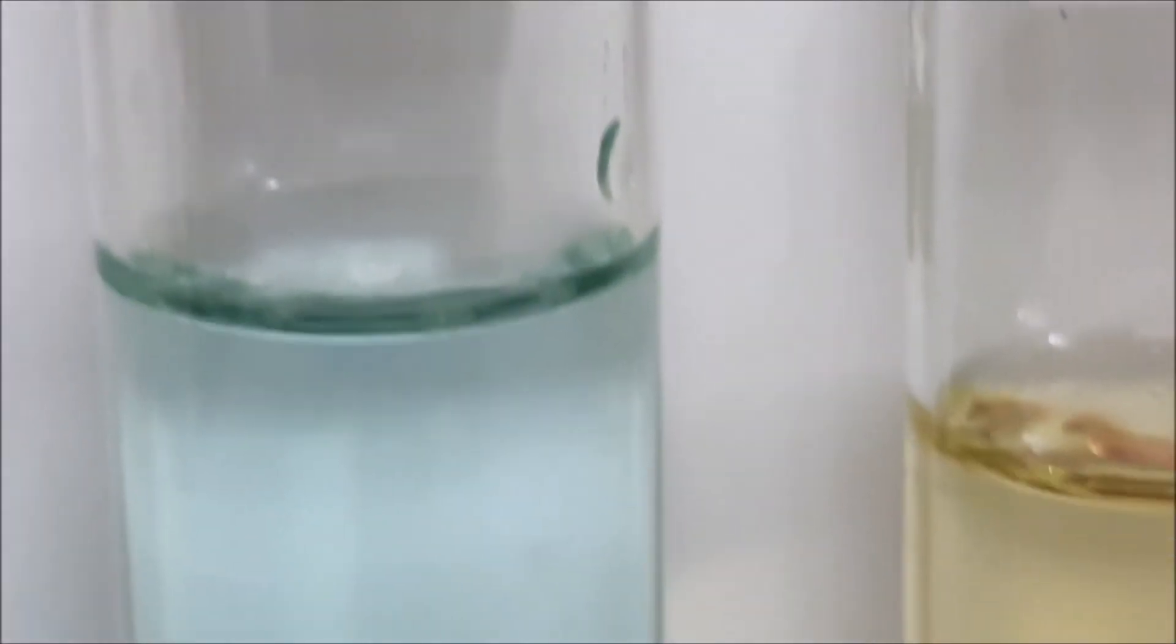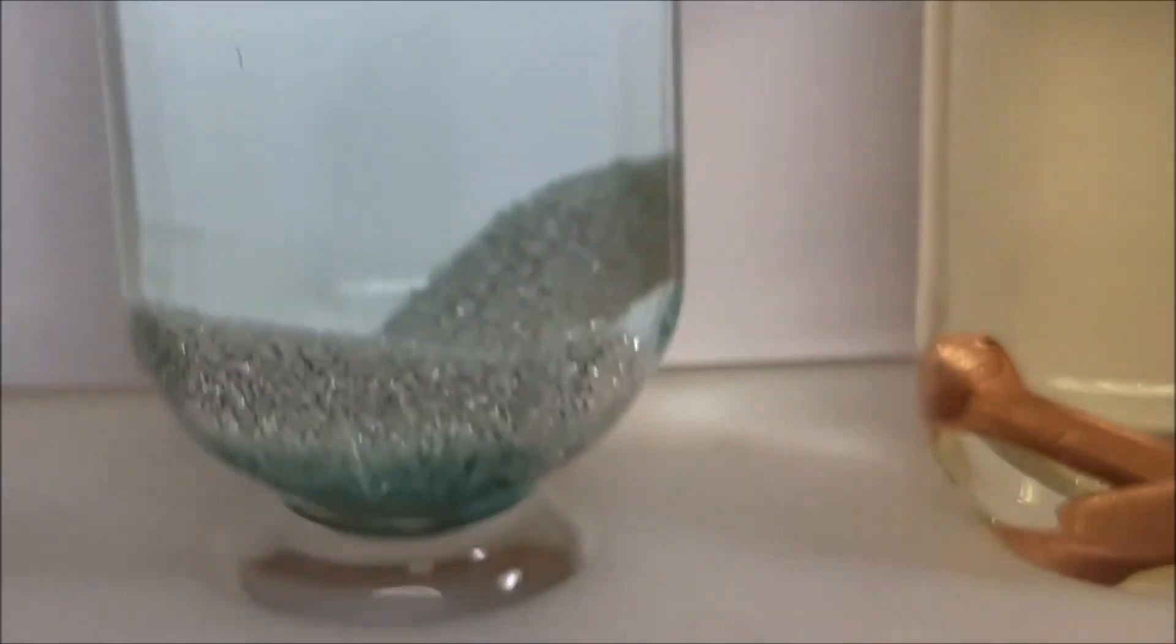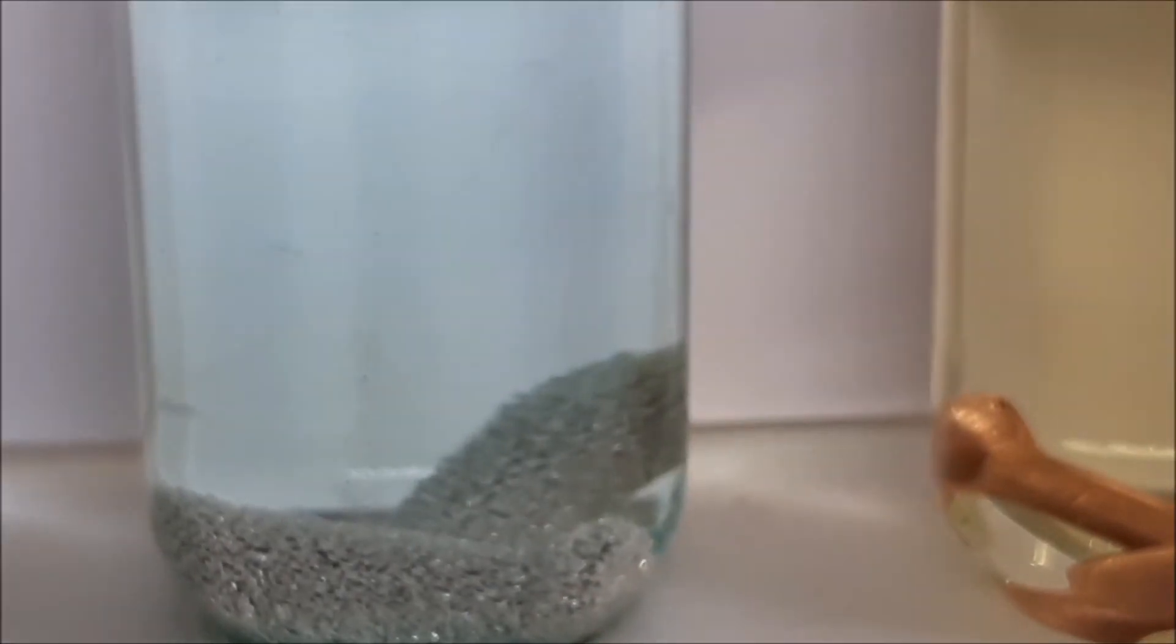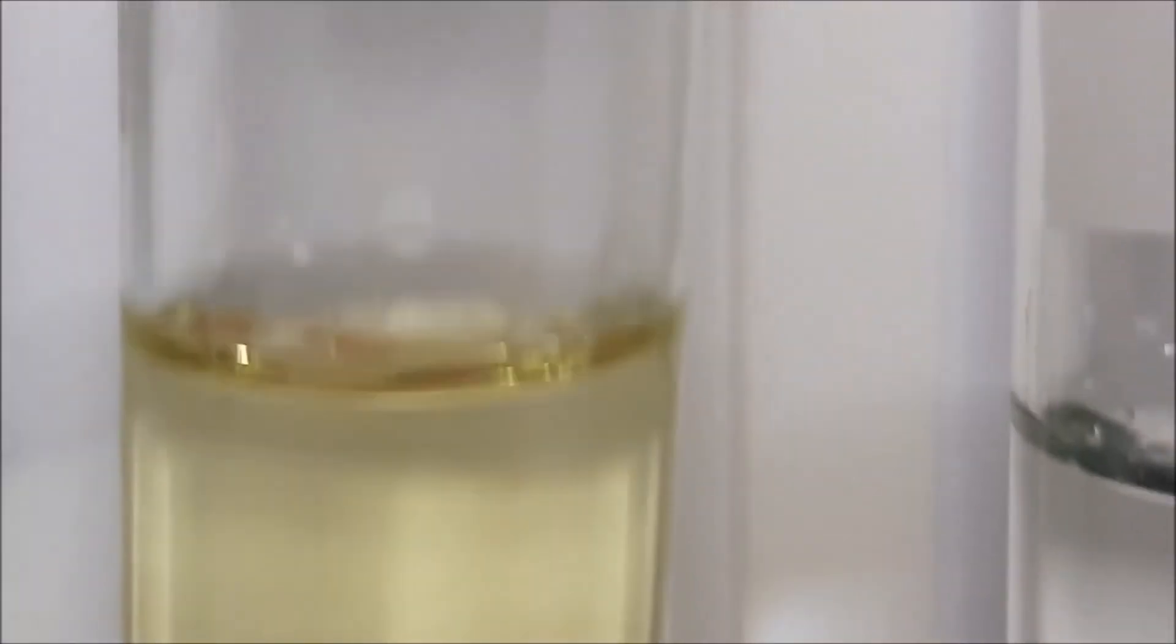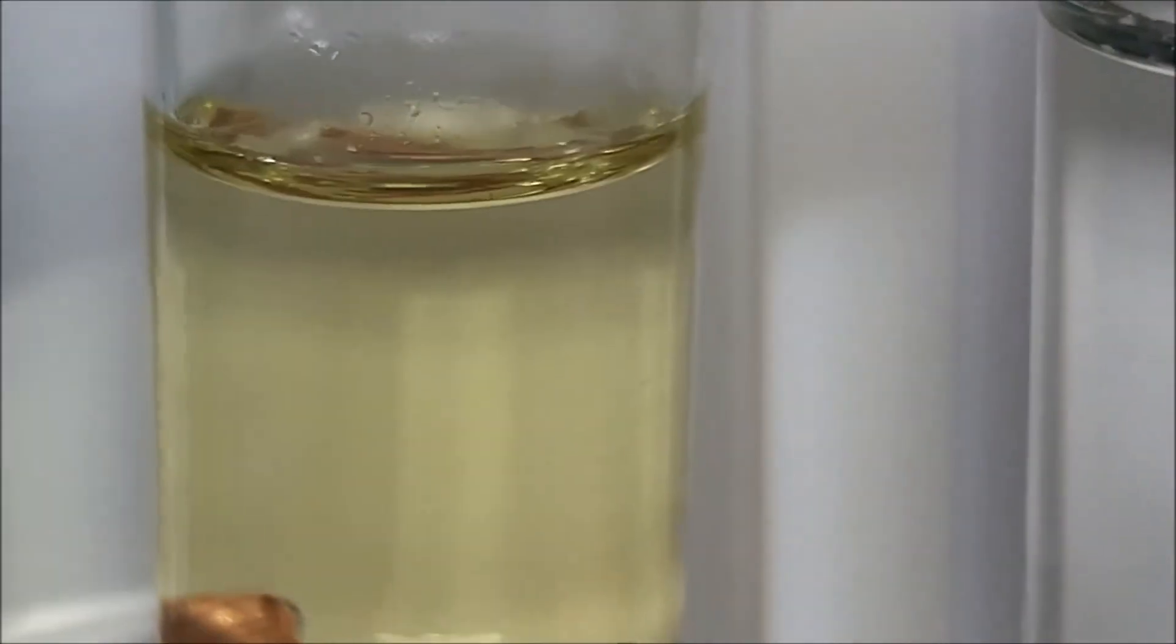For number two, we have copper and silver nitrate. So we will see that the silver coated the copper. And then we have copper plus HCl, no reaction.